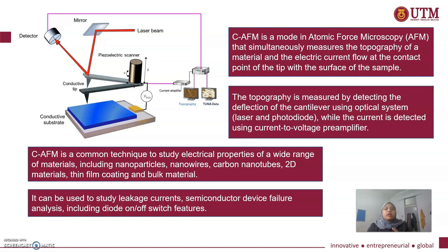CAFM is a common technique to study electrical properties of a wide range of materials, including nanoparticles, nanowires, carbon nanotube, 2D materials, thin film coating, and bulk material. It can be used to study leakage current, semiconductor device failure analysis, including diode on-off switches.